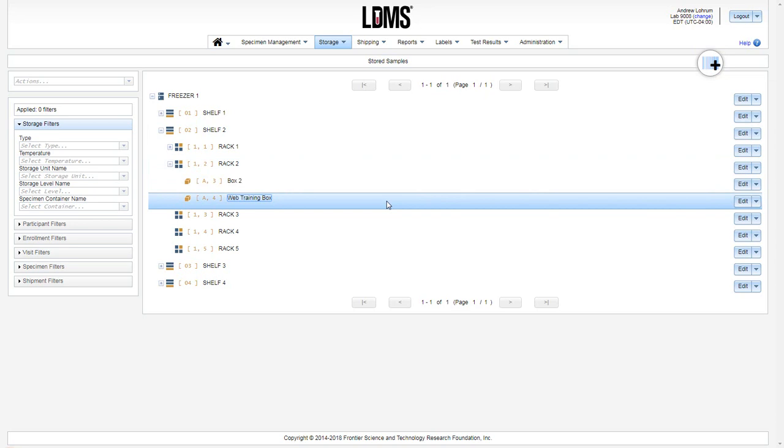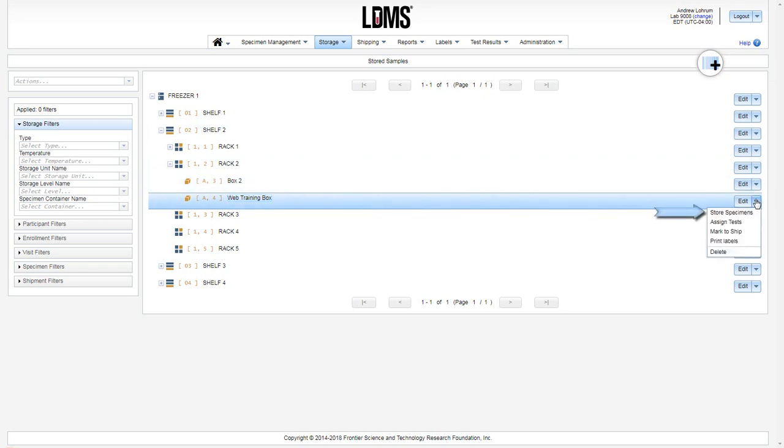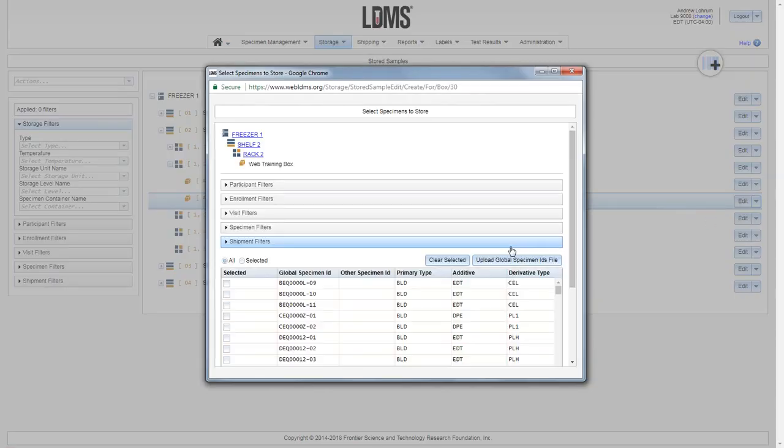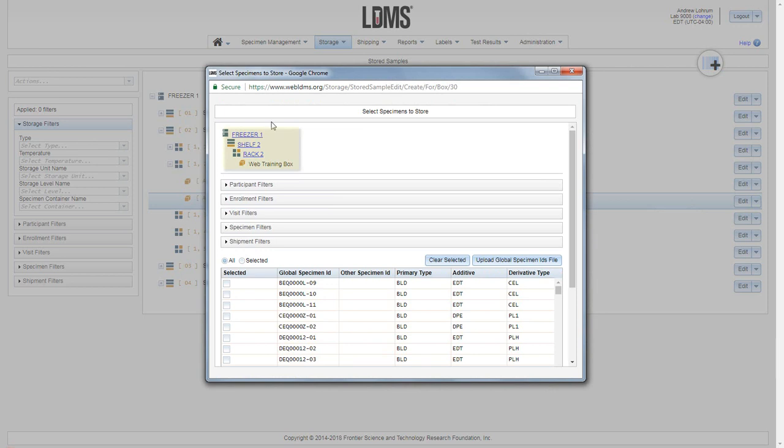There is also a menu option at the container level to store specimens. Select. At the top of the select specimens menu we see the freezer, shelf, rack, and then the container name that we are adding specimens to.